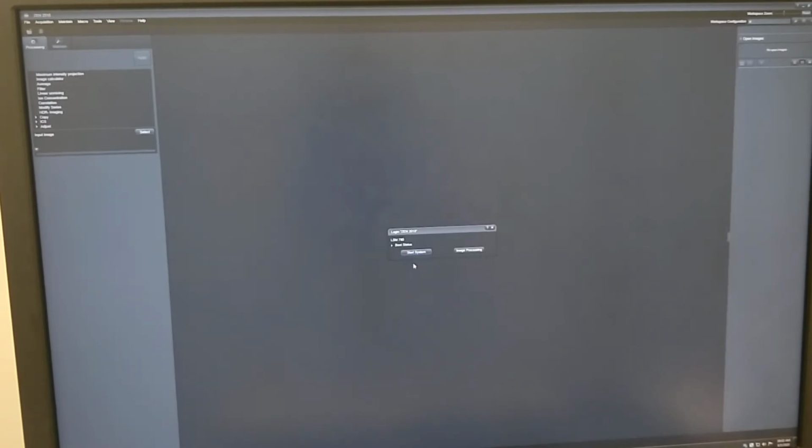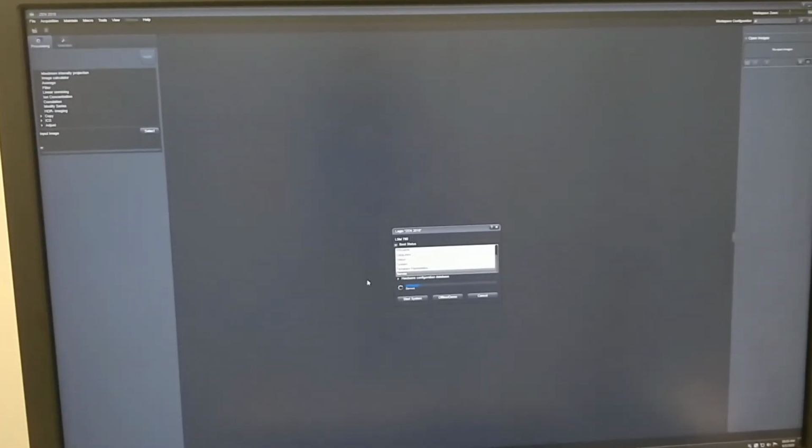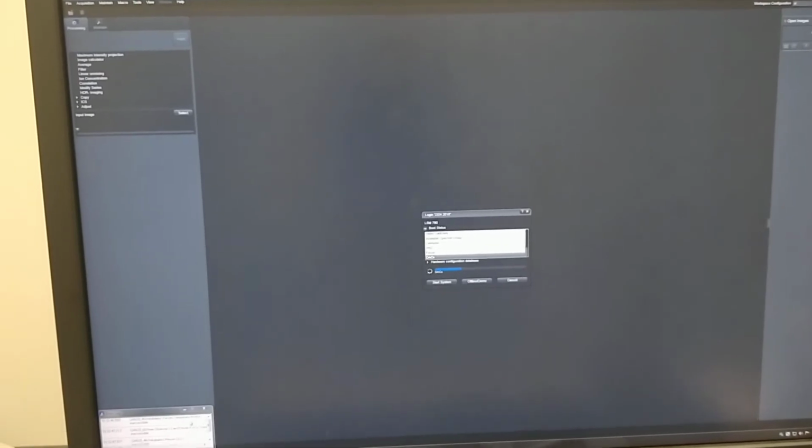All of those you should do in the analysis station, because that is completely free for our microscope users. Here, you are paying to actually use the system, so you're going to click on Start System, and this is where everything's linked. You have this small triangle here. If you click on this triangle, you're going to see what is connected. If there are any errors, it's either going to show up here, as not connecting properly, or you are going to have an error log down here, and you're going to see that error log in a few minutes. Here you go.